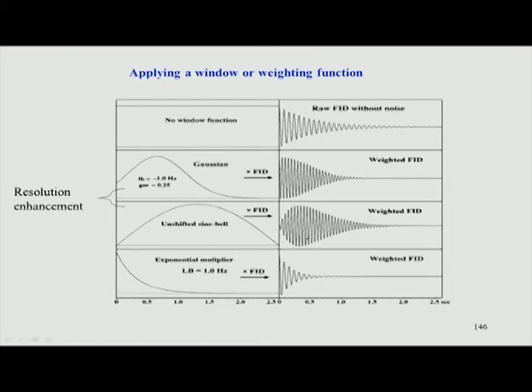And why is that? Because the spectrum is given less importance here, which is where the sensitivity is. So, the signal to noise goes down, but the resolution improves. So, therefore, in NMR, that is the major standard thing which we say, that if you want to gain sensitivity, you have to lose resolution.